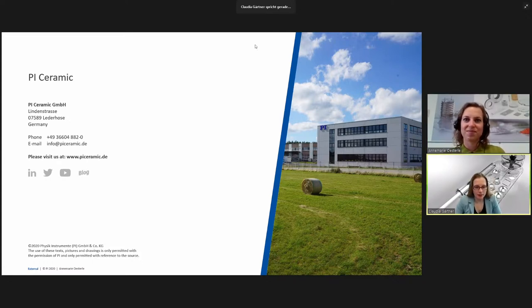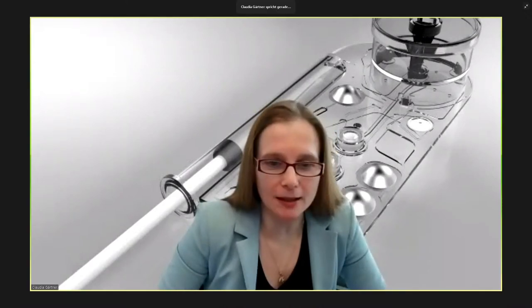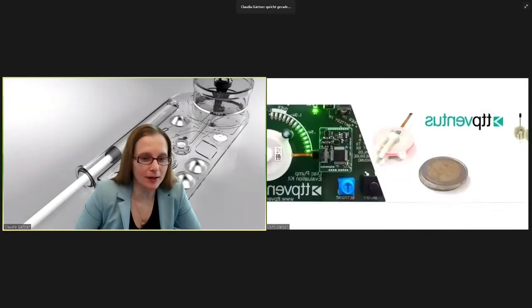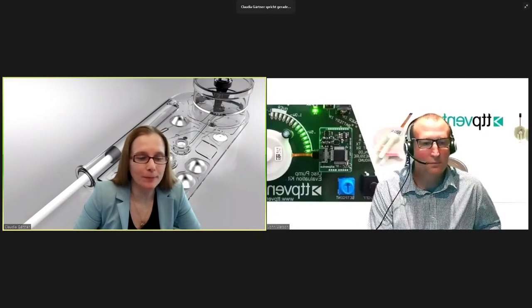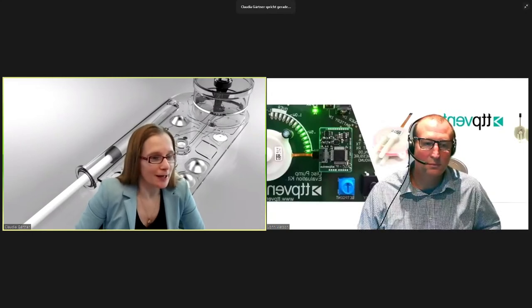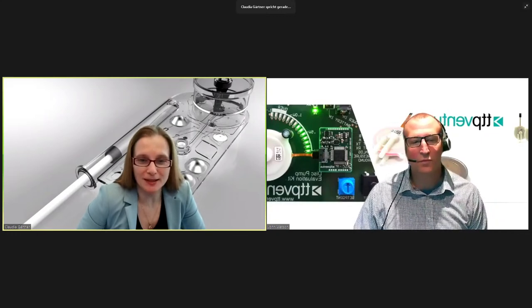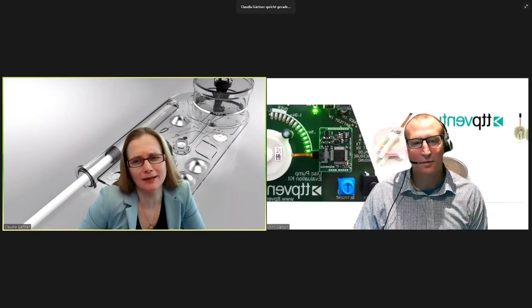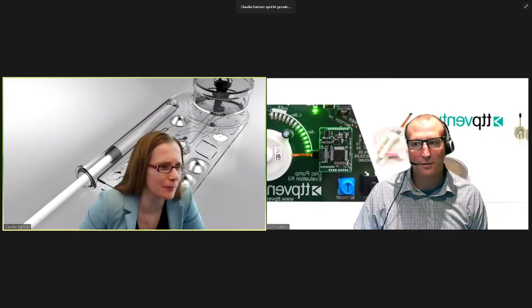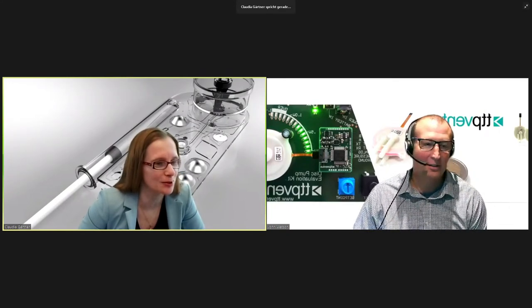Okay, with this, we will move to the next presentation. Now we were with the material in Germany, and now we move to the pump, a little bit more integration, going through Great Britain and learning about pumps, microfluidic handling, and in particular, pulsation-free handling of microliquids, which is an extremely fascinating topic. Okay, John, let us hear about the news, what you achieved last year.